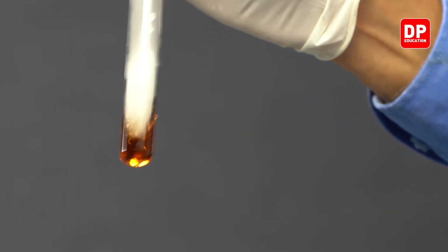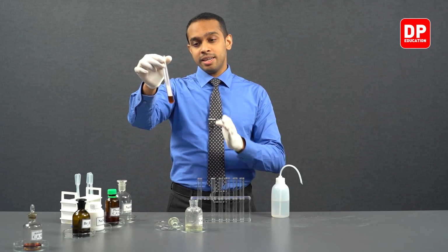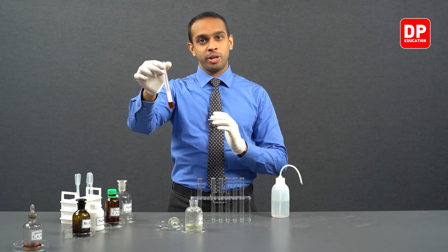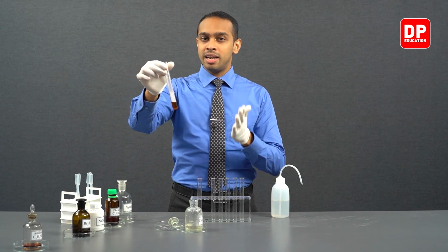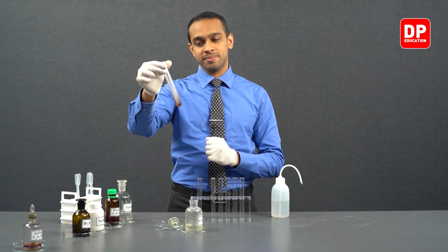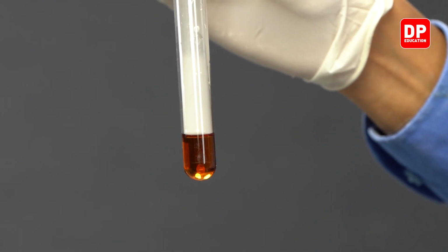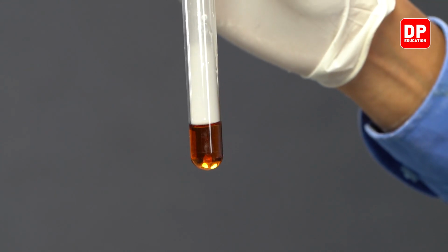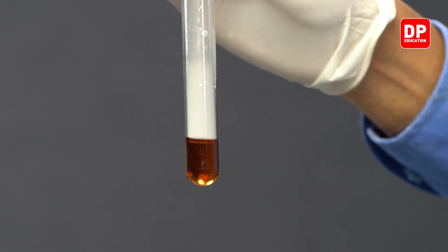When aniline is reacted with hydrochloric acid, we form a salt, anilinium chloride. And it is soluble in water. As you can see, there is no layer separation. That means when we react HCl with aniline, the salt that is formed is soluble in water.